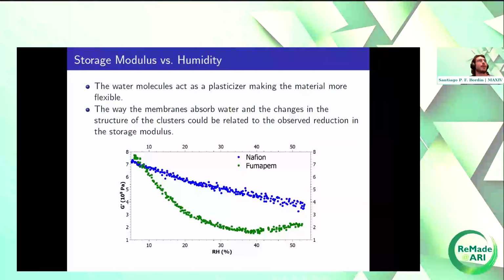So for the mechanical test, we studied the storage modulus. Here we have the difference between the Nafion and Fumapem membrane. For Nafion membranes, there is a linear decrease trend, but in the Fumapem it's more exponential.